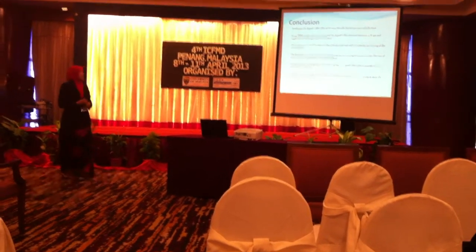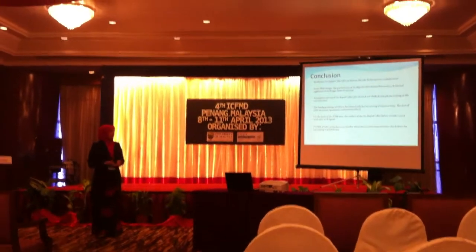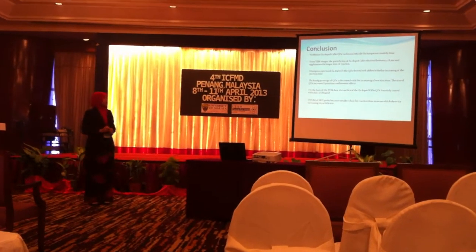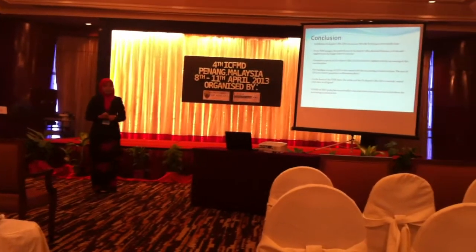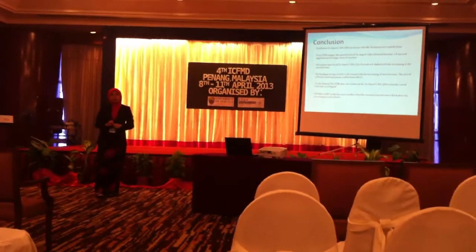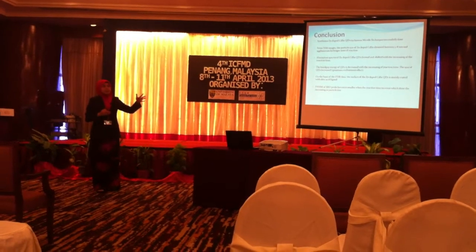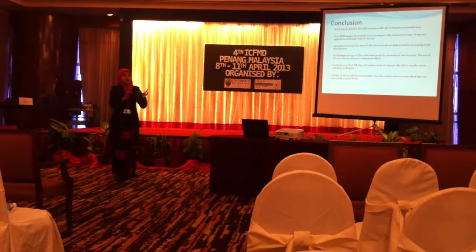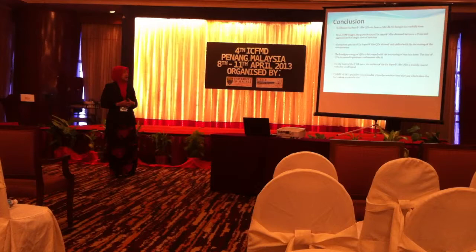Okay, for the conclusion part, in this project, synthesis of zinc-doped cadmium selenide quantum dots via the inverse micelle technique was successfully done. And from the TEM images, the particle size of zinc-doped cadmium selenide obtained is between 2 to 8 nanometer, and it agglomerates for longer reaction time. So for longer reaction time, more than 90 minutes, maybe the particles become more agglomerated and it is difficult to obtain the particle size.